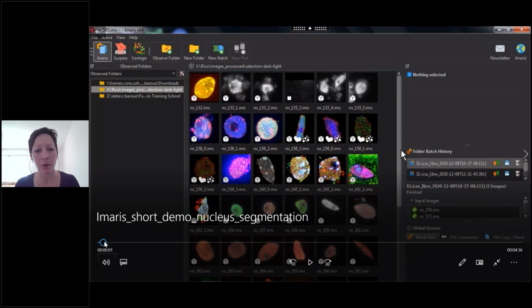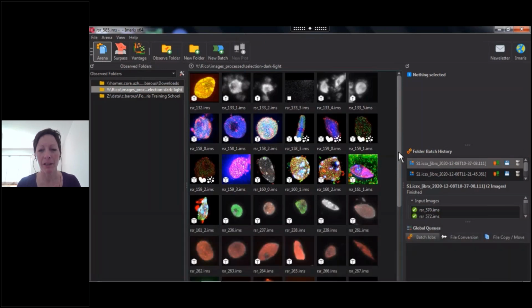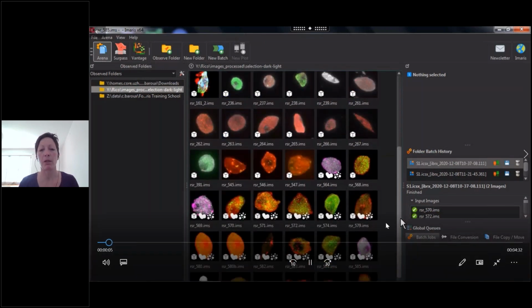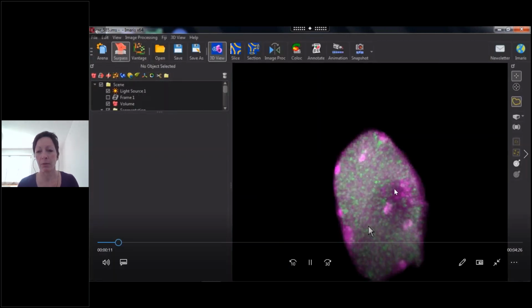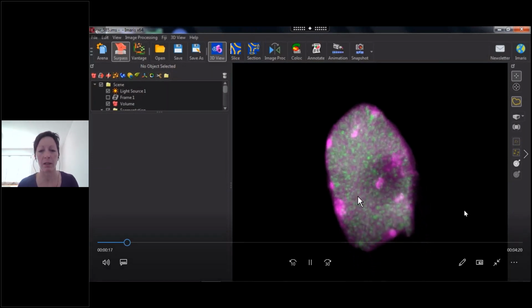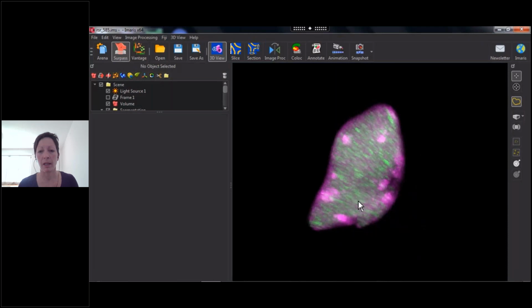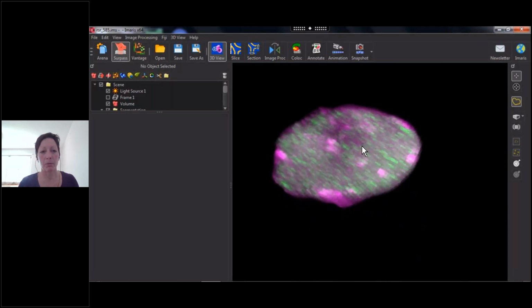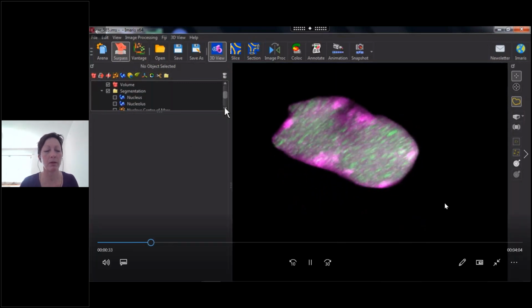I hope that you see now my little video. I start to play it. I wanted to move away from a flat, dormant PowerPoint slide and show you how it looks in IMARIS. In IMARIS, we have what we call an arena, which allows you to browse through your image collection. You can select the image that you want to analyze. In that case, this is a nucleus stained in magenta for the DNA and in green for an antibody. You see that it has this kind of punctate signal. And then in IMARIS, what we were doing is to segment. So I'm moving in 3D. It is already prepared in this animation.